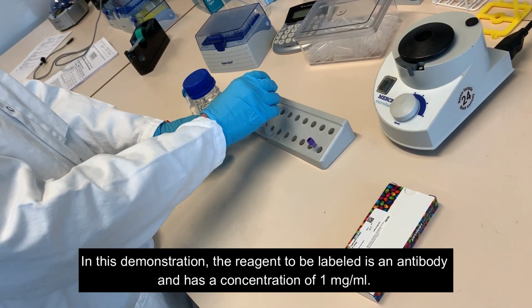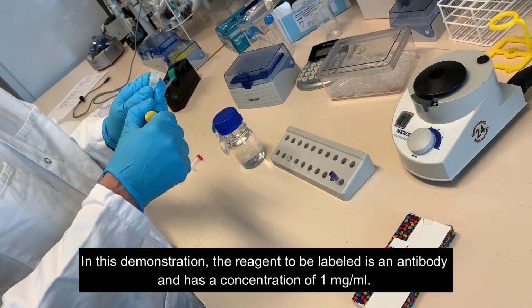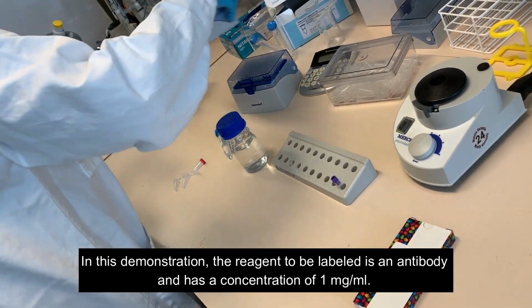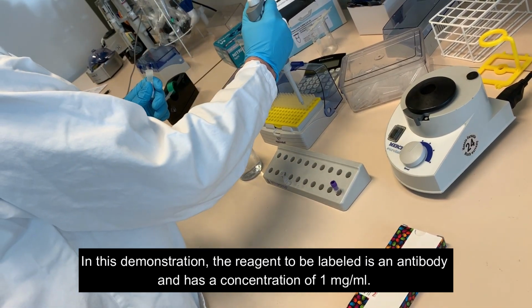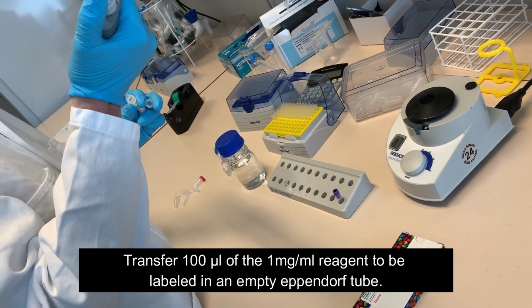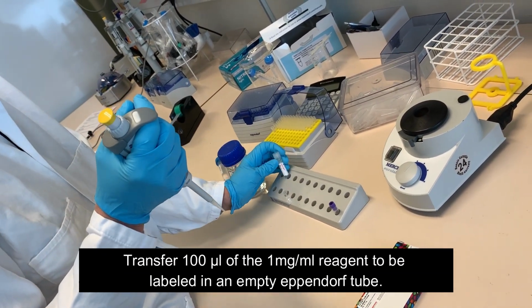In this demonstration, the reagent to be labeled is an antibody and has a concentration of 1 mg per ml. Transfer 100 microliters of the 1 mg per ml reagent to be labeled in an empty Eppendorf tube.